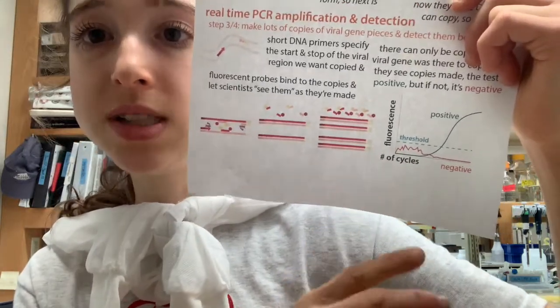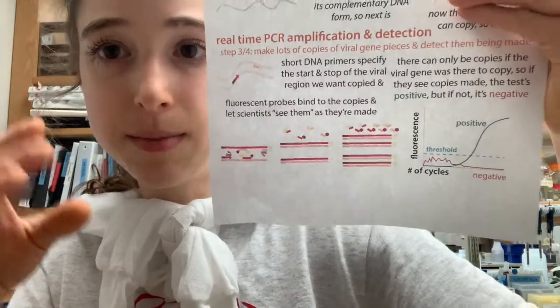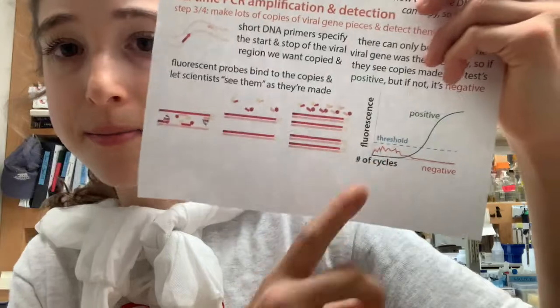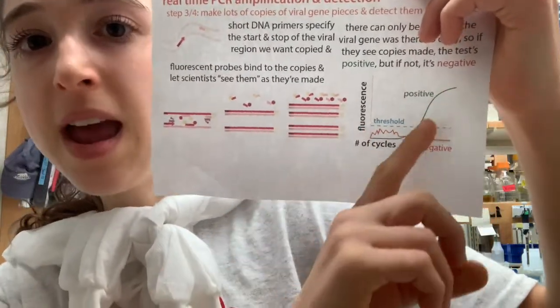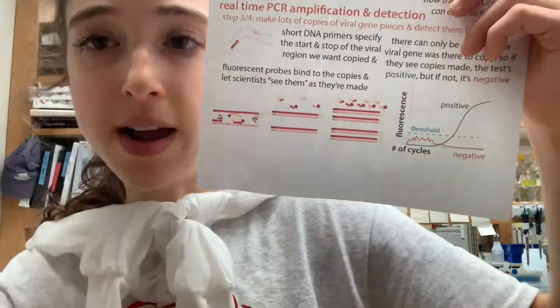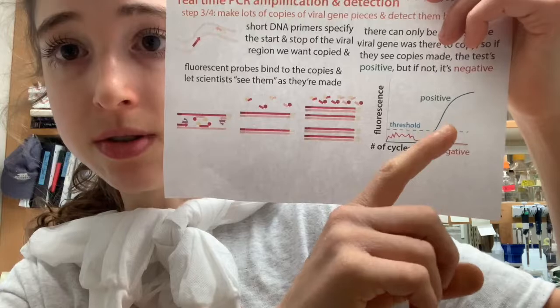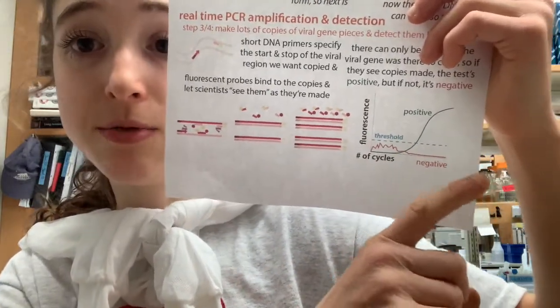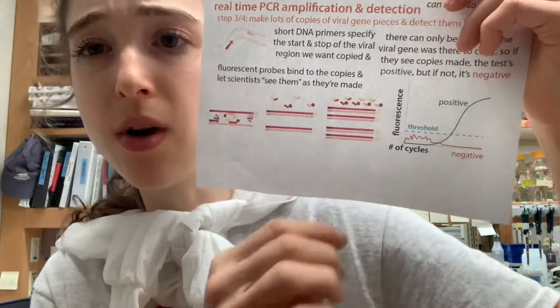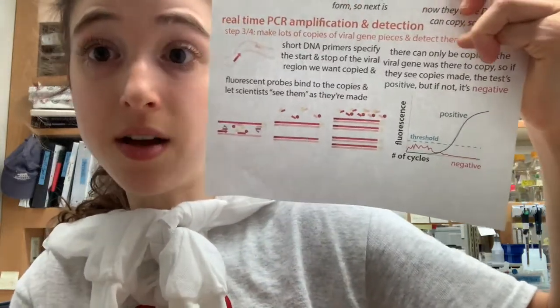So if you have a low CT value, that means it only takes few cycles. Usually in the 20s or so cycles to pass that threshold. And then you start leveling off because you run out of probes and that sort of thing. But that would be a positive result. You can still be positive, but have a really high CT count. So you don't have much virus. So you might be in the very beginning or the very end of the infection.